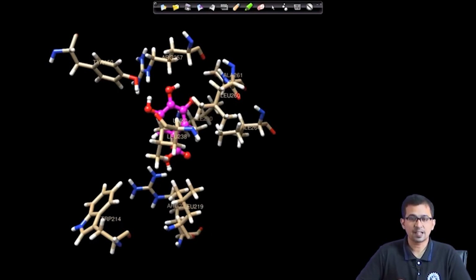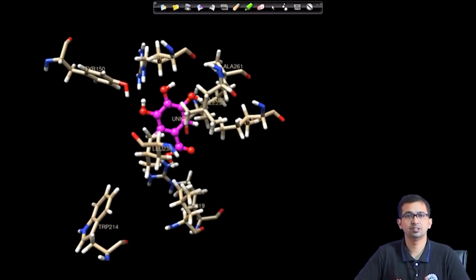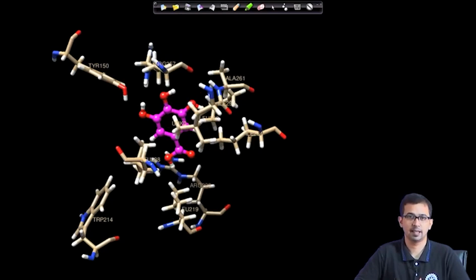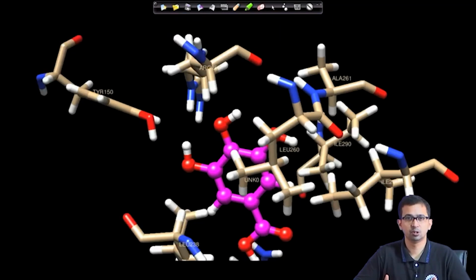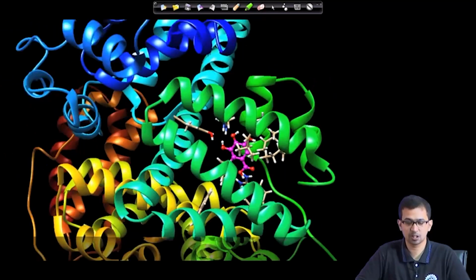In this part we can see that several residues are surrounding this gallic acid, and these residues are kept at a distance of around 3 angstrom from gallic acid. So, we can actually estimate the number of residues around it. These are the images, or the video, taken from various angles in the software. Now we can see the structure of gallic acid within the protein moiety.